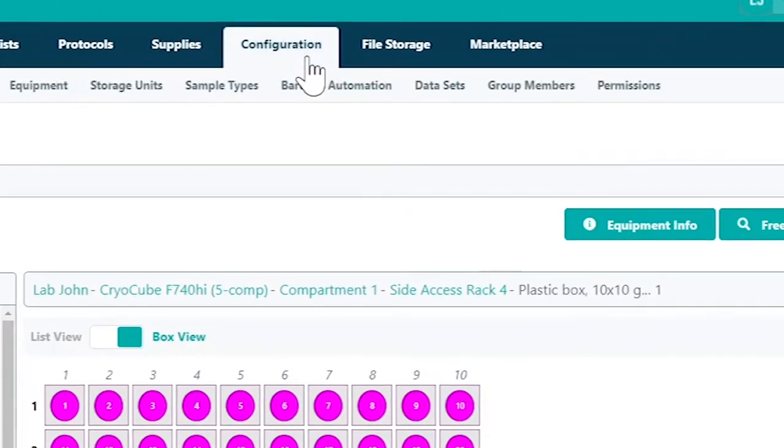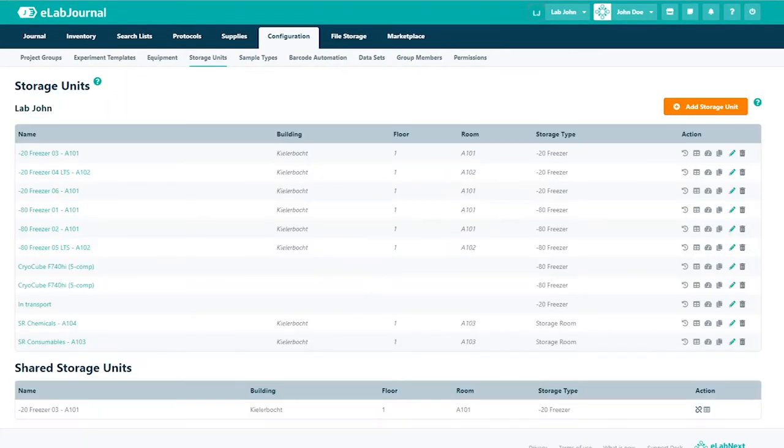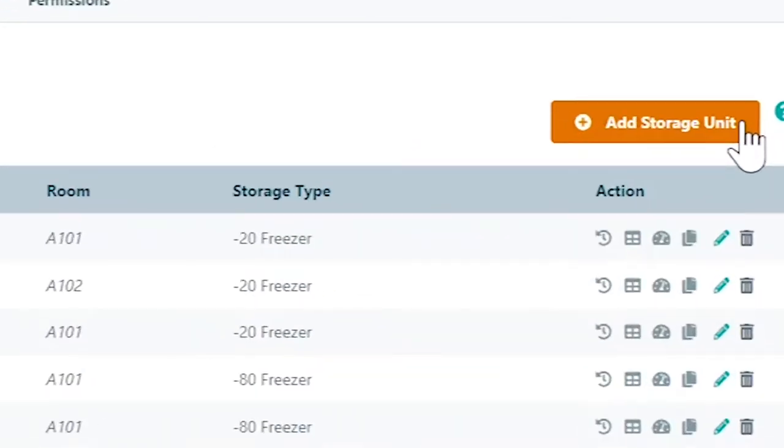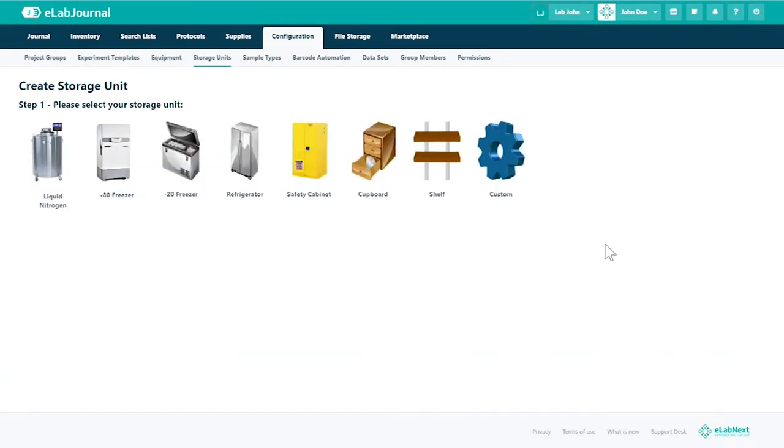Begin by navigating to storage units under configuration, then click add storage unit. You may select from the options available or create a custom storage location.